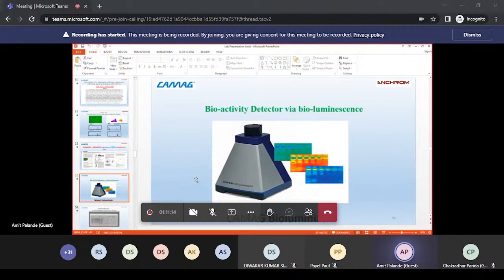Method development and quantification of miltefosine in tablets and capsules. Miltefosine is an antimicrobial drug, and the capsule was visible after derivatization. So you can see this image after derivatization.